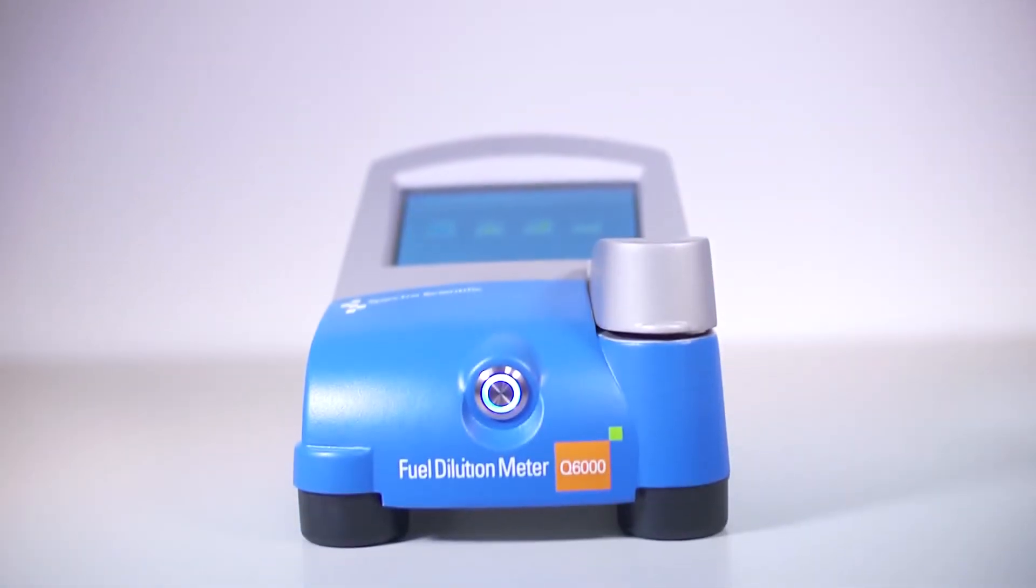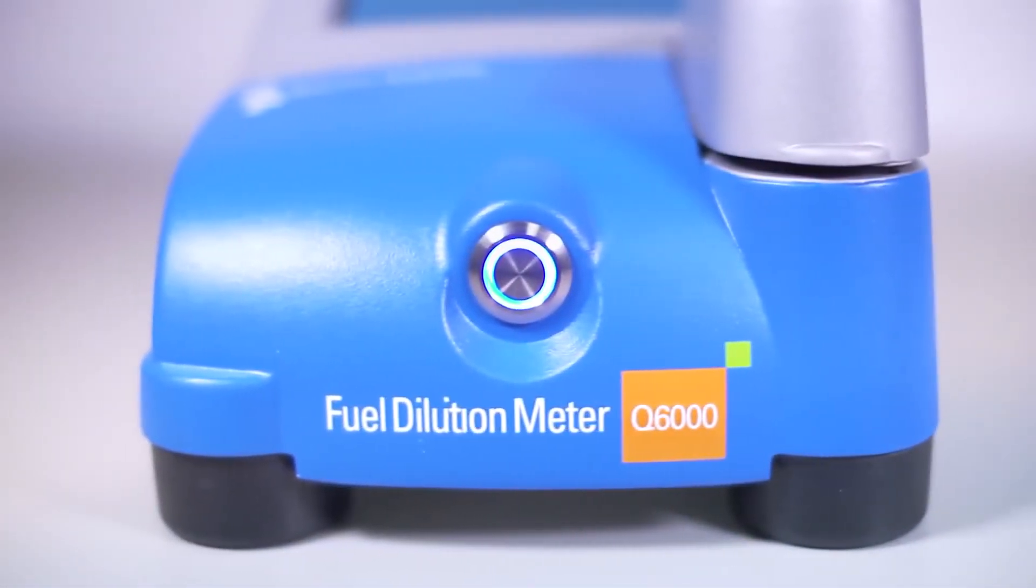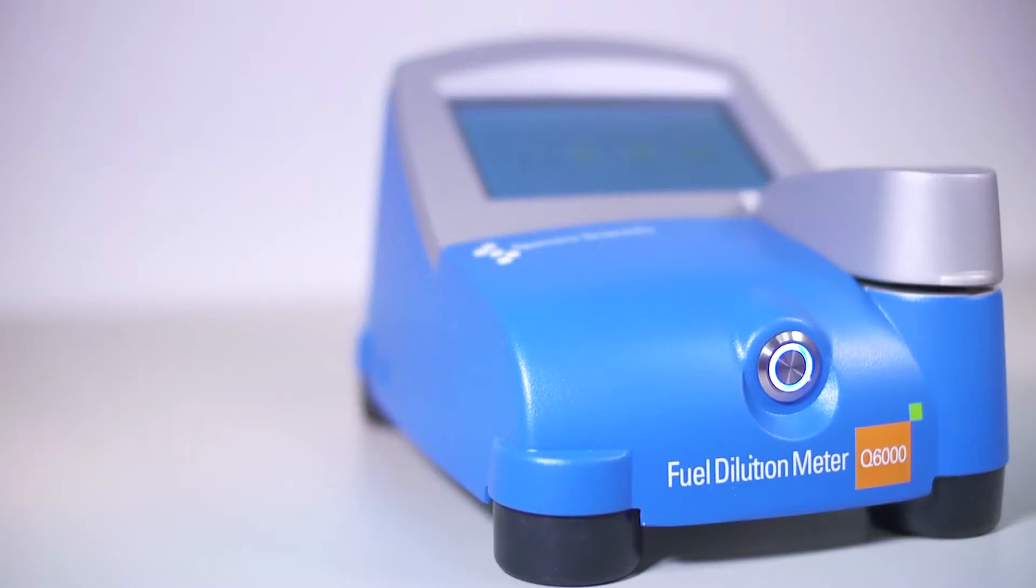The Q6000 is a portable fuel dilution meter that can be used in the laboratory or the field to provide rapid and accurate measurements of fuel contamination in engine oil.